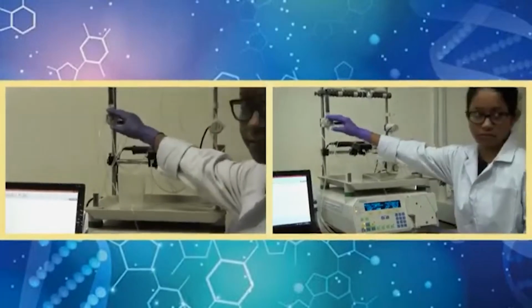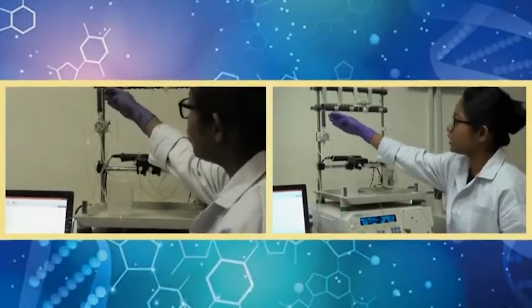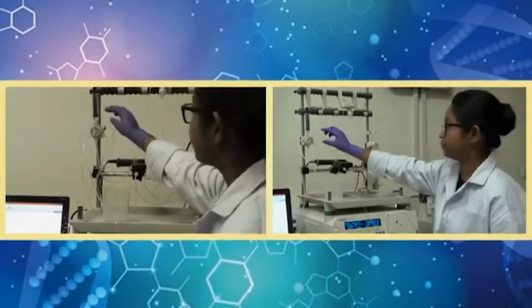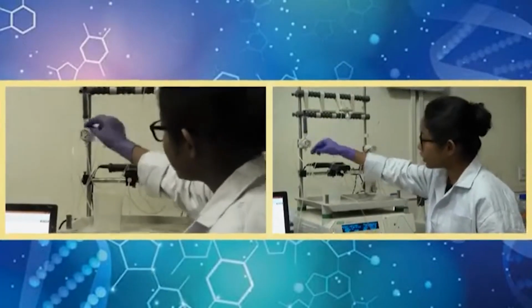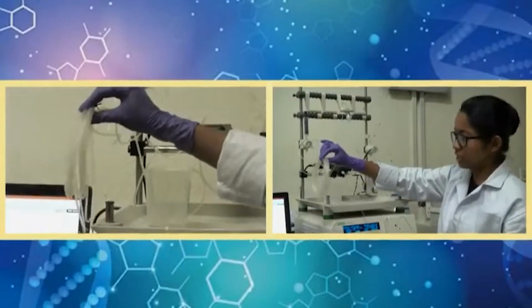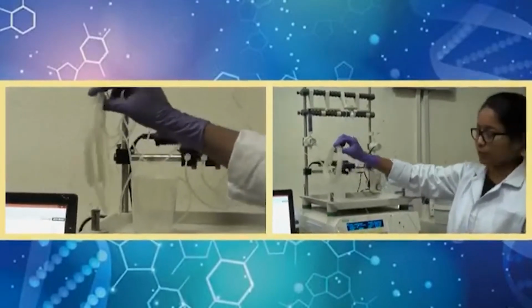From this pump the buffer will go into this valve. In this system, you load your sample with the help of an injection tube. After loading, the sample will go inside a tubing. This is a big tubing, but it contains only 10 ml volume of your protein.